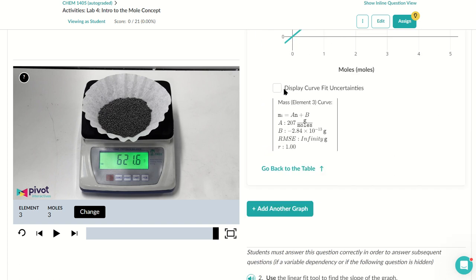Okay, so here, this is giving you a line. Y equals mx plus b. M happens to be called A. N is your variable. B is still called B. That's just your intercept. So you don't need to overthink that. All you need to do is extract some information from there. So your A is your slope.